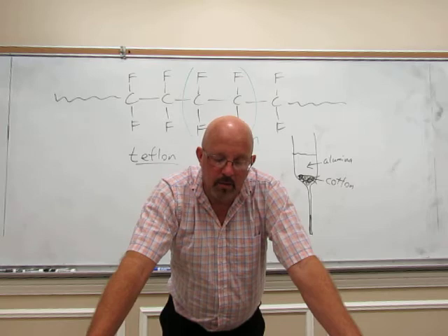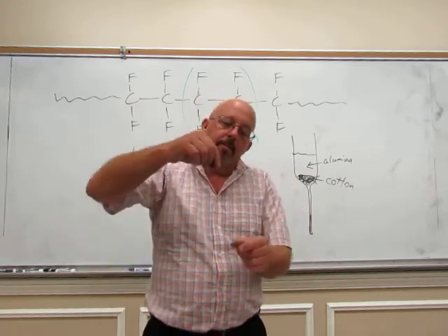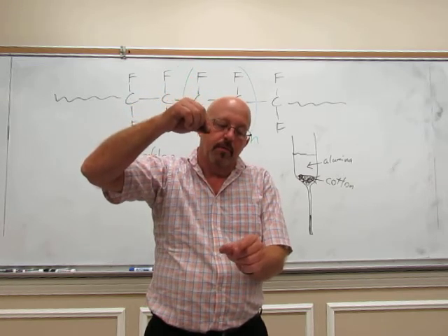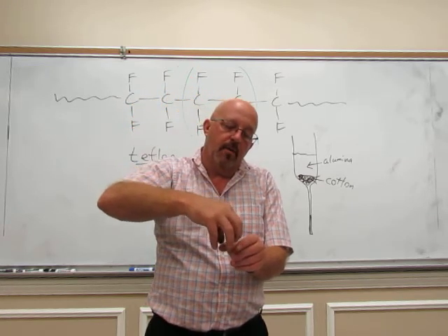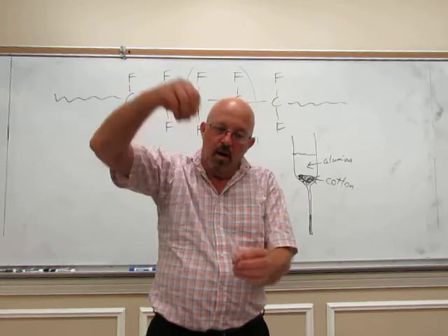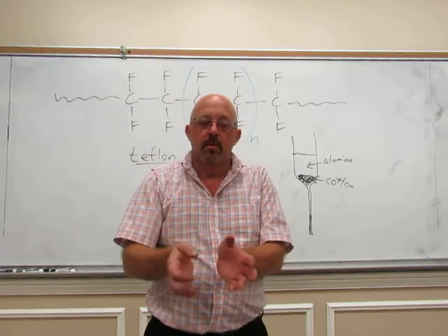You want to monitor the polymerization using that boiling stick. Pull the boiling stick up out of the test tube, and the polymer, the polystyrene, should string off of it, form fibers. If it's not, it needs to cook some more.